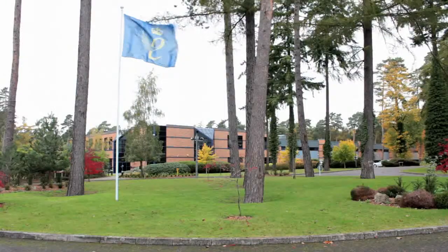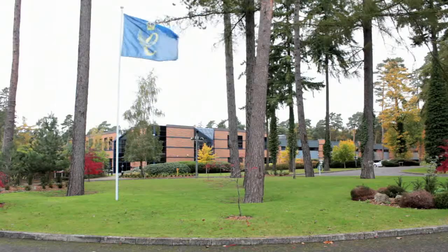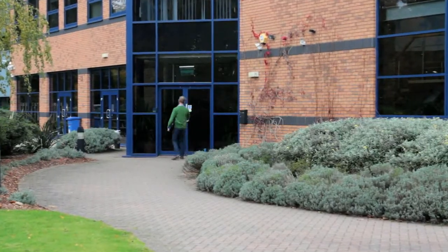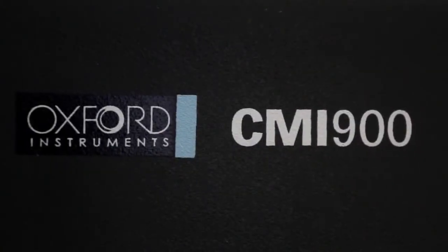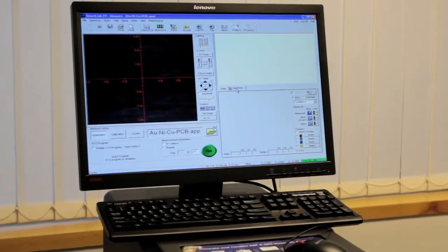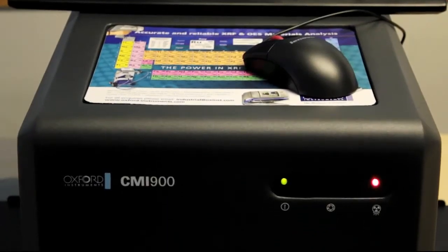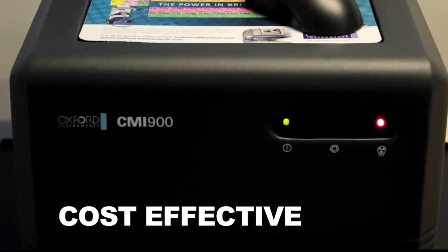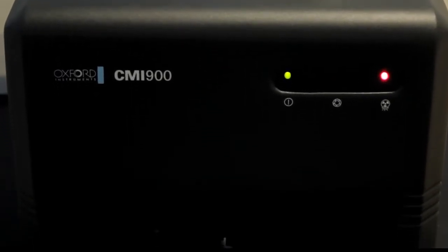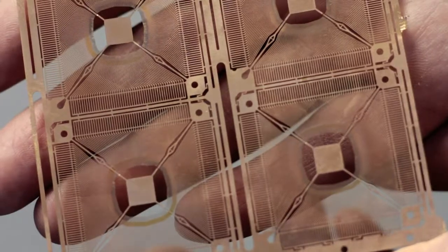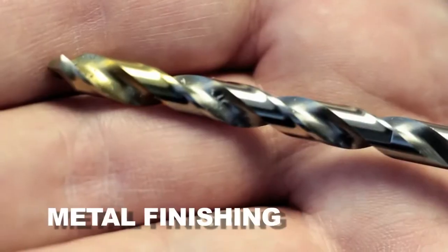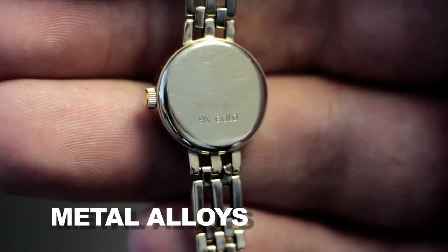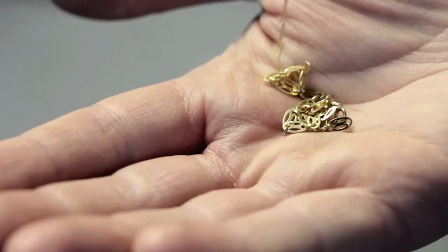Oxford Instruments has over 35 years of experience designing and manufacturing X-ray fluorescence spectrometers. The CMI-900 is a robust, easy-to-use, cost-effective tool used to analyze a wide variety of materials in the quality and process control of many industries, such as electronics, metal finishing, and metal alloys, such as gold alloys.